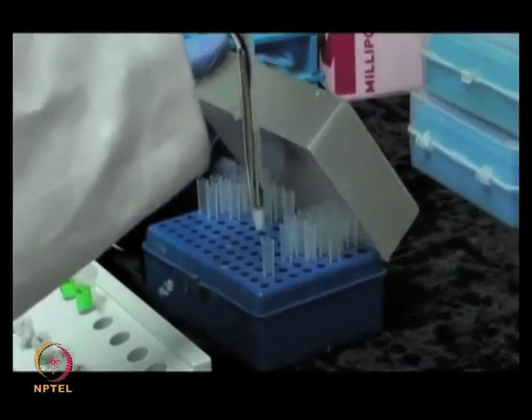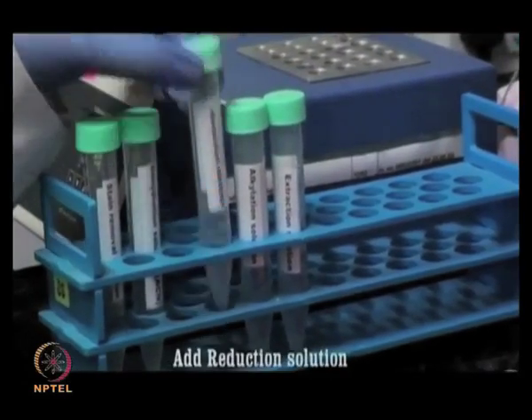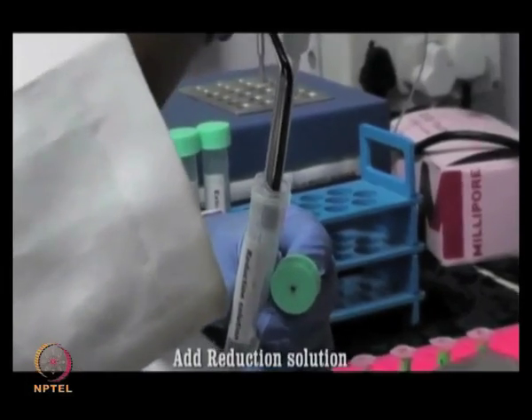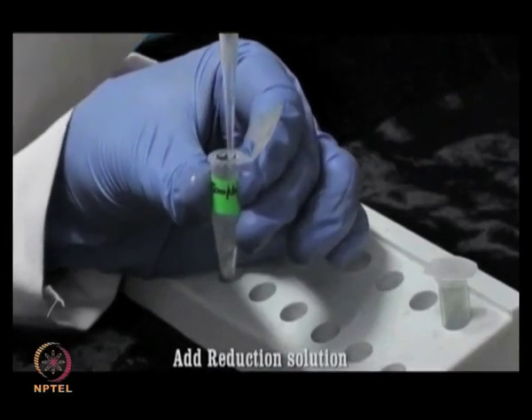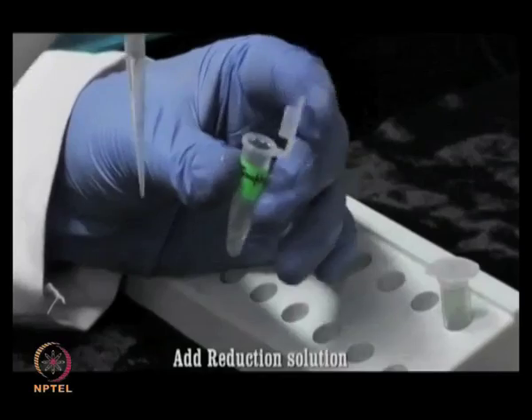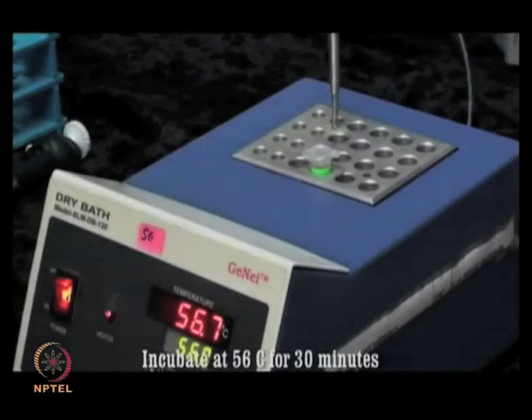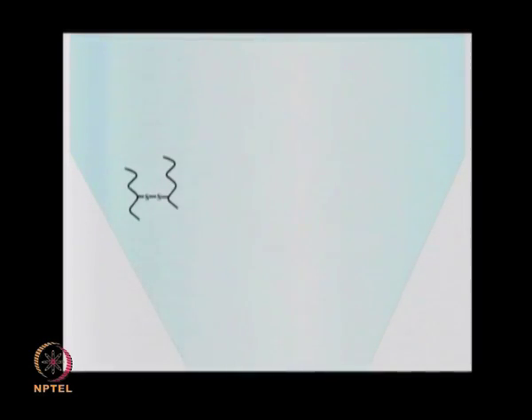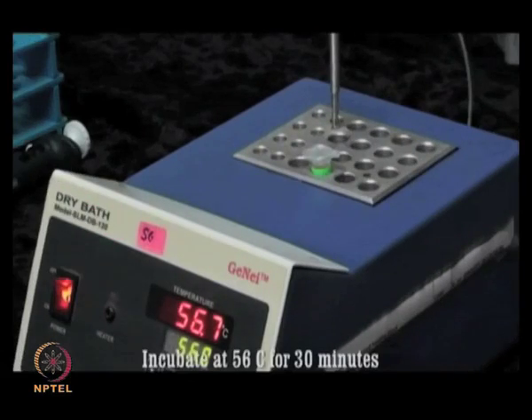After removing the solution completely, add reduction solution. So, add 30 to 50 microliters of reduction solution to completely cover the gel pieces. Incubate it for 30 minutes at 56 degrees centigrade. Now, treatment of protein residues with dithiothreitol breaks the disulfide bonds.